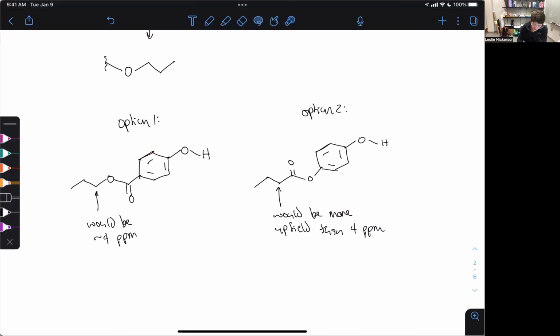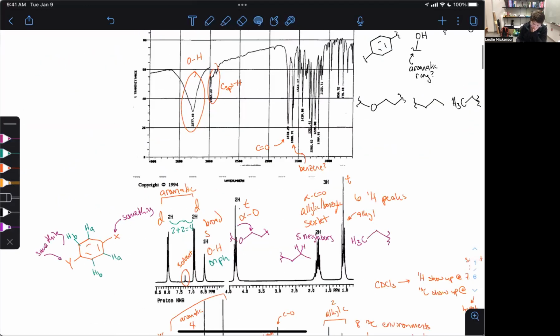So one last thing that I like to do is to go ahead and assign the peaks.